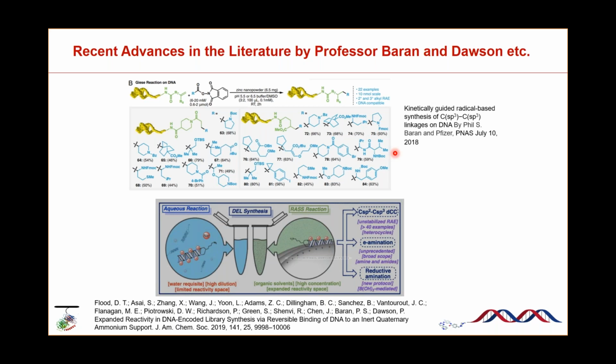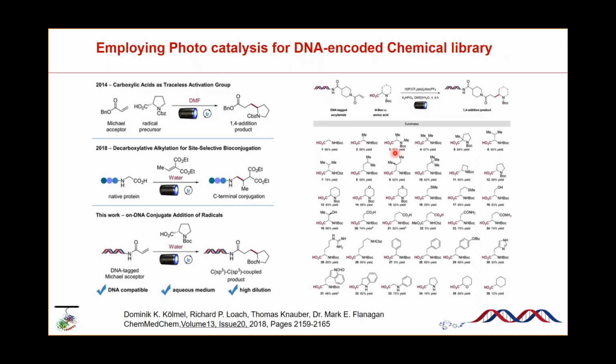Organic chemistry is quite useful. We recently applied this resin concept to some other reaction development. We also found that the resin condition could have a better substrate scope compared with the traditional aqueous-only reaction. At the same time, the scientists at Pfizer have also come up with the photochemistry concept.